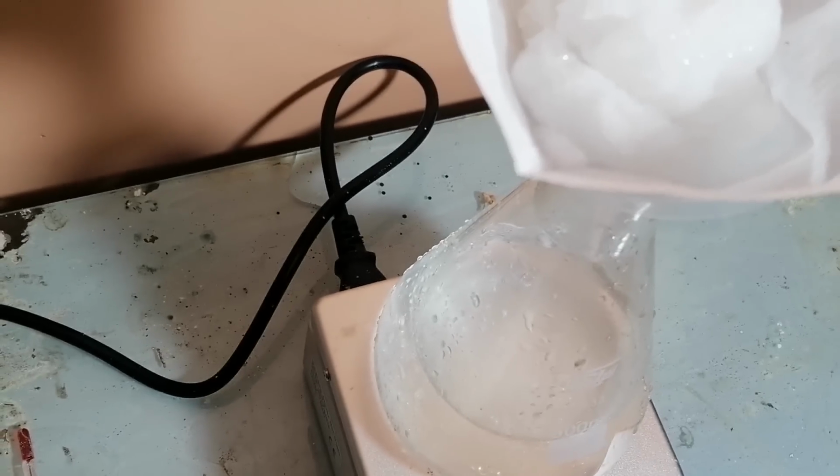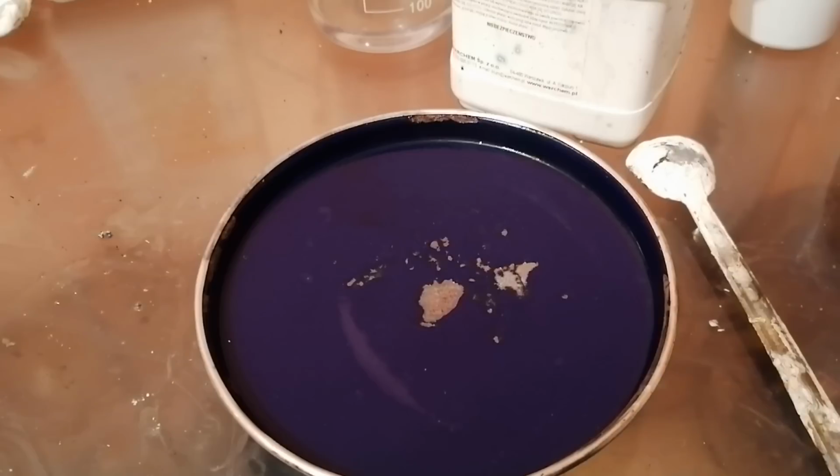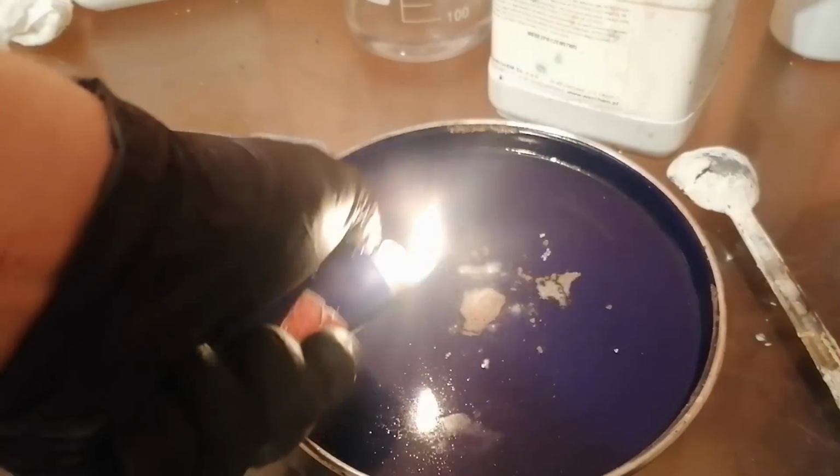Another cool thing which you can do when you have boric acid is combine it with methanol to produce methyl borate, which burns this really cool green color. So anyway, I did just that, and here you can see this really beautiful flame.